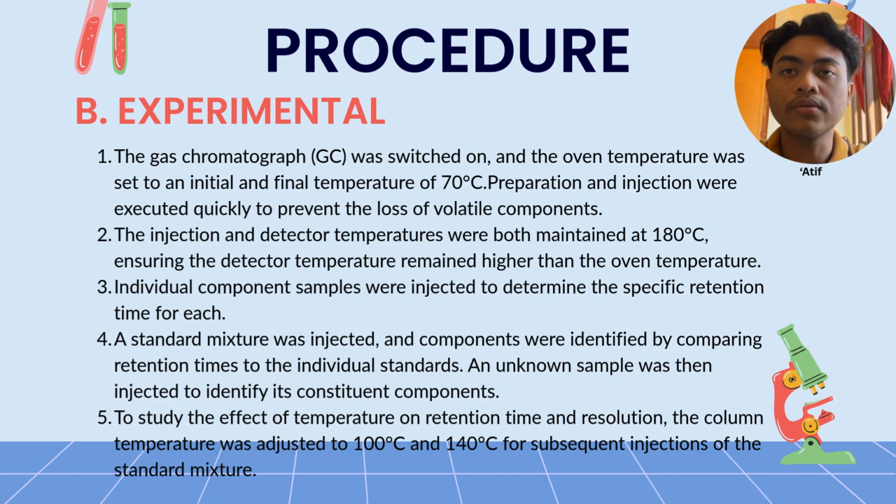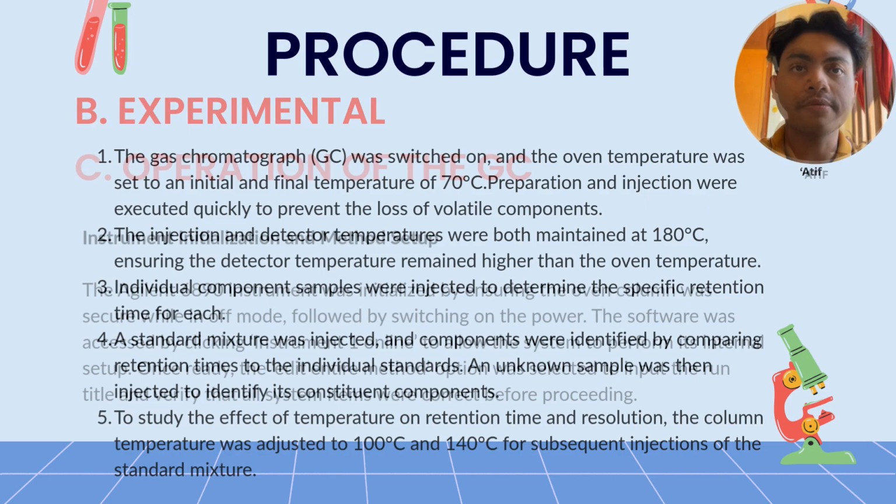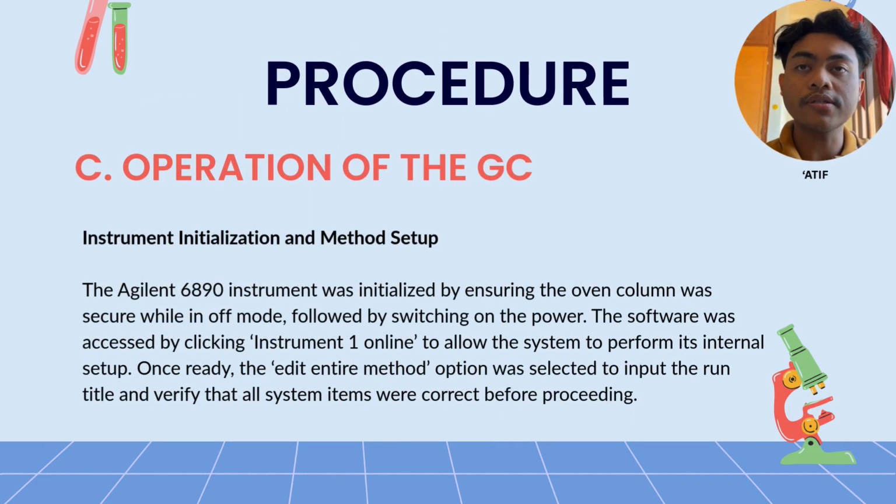And lastly, to study the effect of temperature on retention time and resolution, the column temperature was adjusted to 100 and 140 degrees for subsequent injections of the standard mixture. And lastly, the operation of the GC.